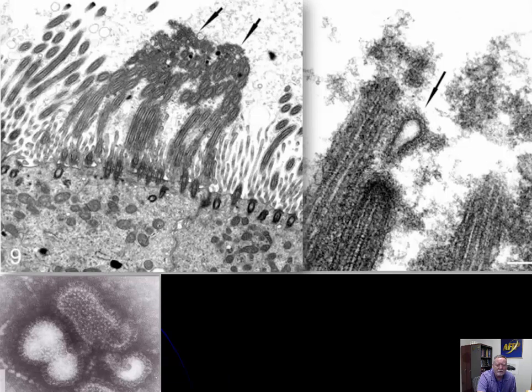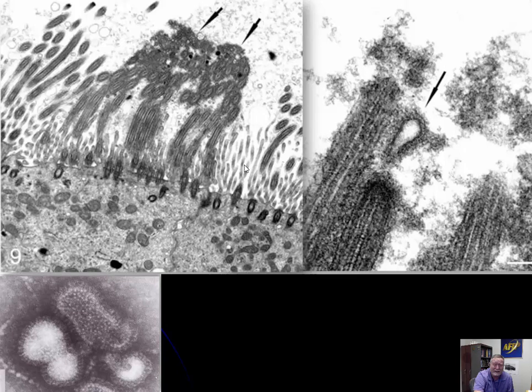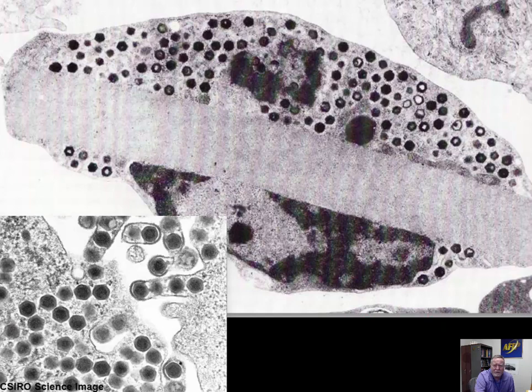Let's look at a couple of other interesting but very difficult to diagnose virus particles. Paramyxoviruses, with the exception of the morbilliviruses, can be very difficult to diagnose — they tend to bud out along cilia or microvilli and are very amorphic-looking particles, bulbous or long. This is iridovirus — a ranavirus — and you can see the particles. Iridoviruses are primarily viruses of amphibians and perhaps insects. They're fun to look at even if we rarely see them.